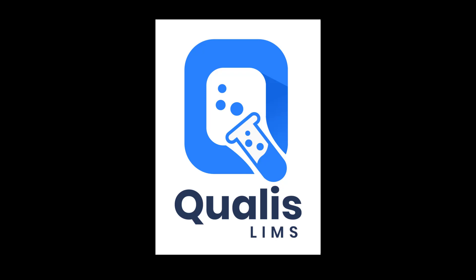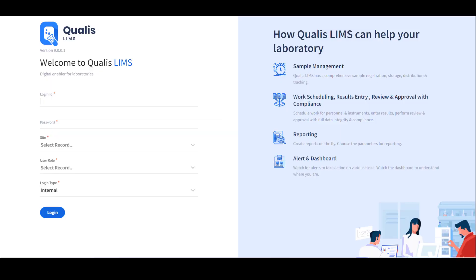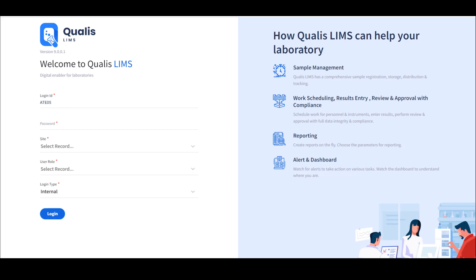Good day everyone. Let us explore Call SLIMS with some key features embedded in it. Call SLIMS is a multi-site facilitated web-based application. To access Call SLIMS, we would open the web link provided by the administrator in the web browser. This opens the login page.